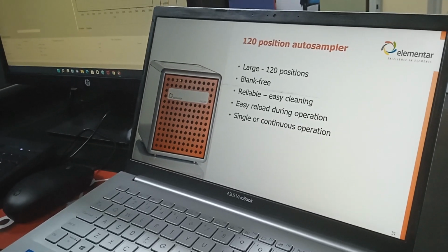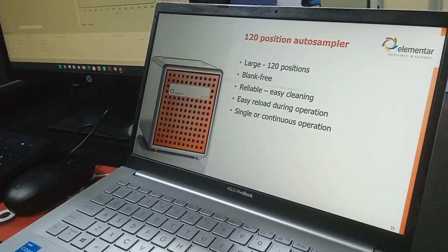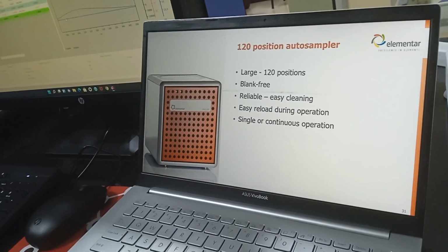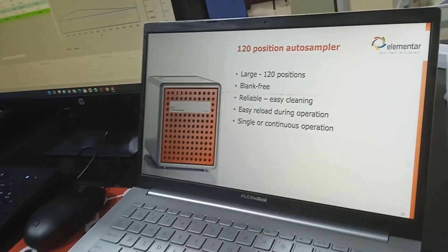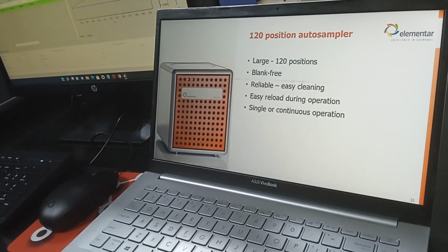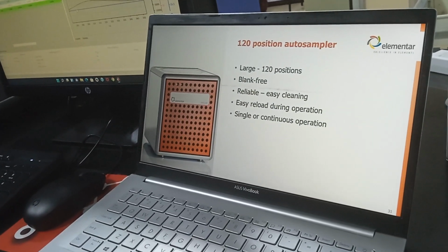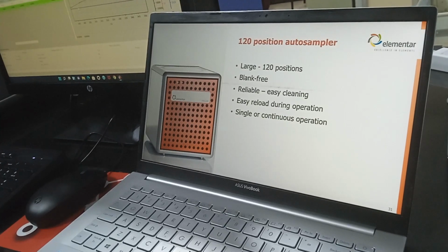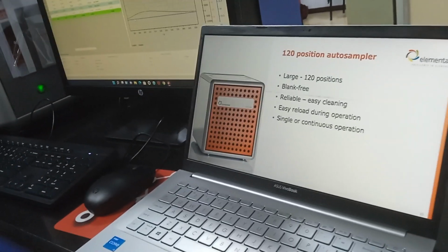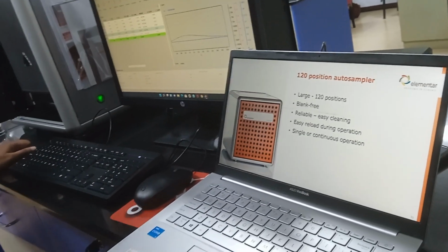One thing here: instead of 120 you are using 80. For soil samples and all, the packing might be bigger, that's why a bigger space is given. If it is 120, that hole will be smaller. That's not the number of samples, not for the soil. Other companies are not using it. It depends upon your configuration.